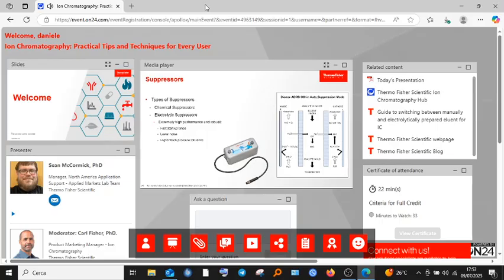On the right-hand side of the screen, we are showing you a view of what is happening within the suppressor. In this case, the eluent, sodium hydroxide, is passing in the inner chamber. On the two chambers on the outside, we have regeneration water flowing through. At the anode, the water is being split to release oxygen and hydronium ion.